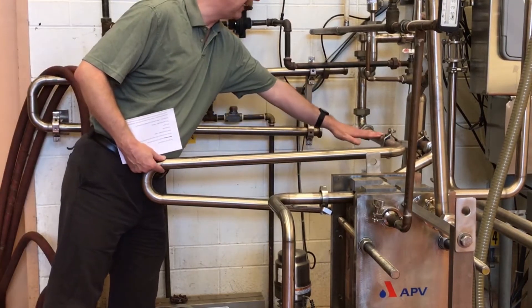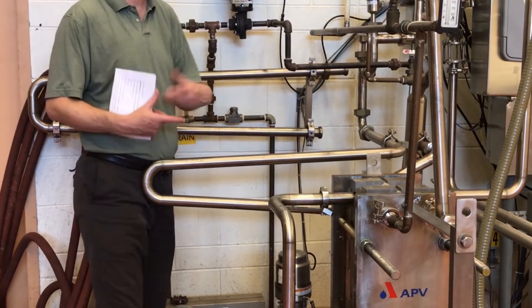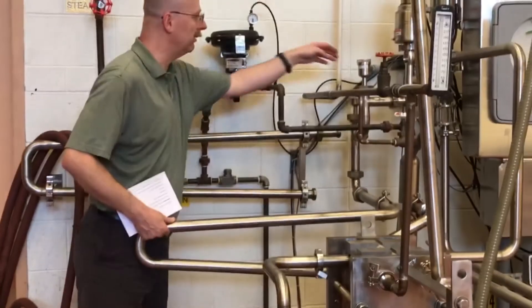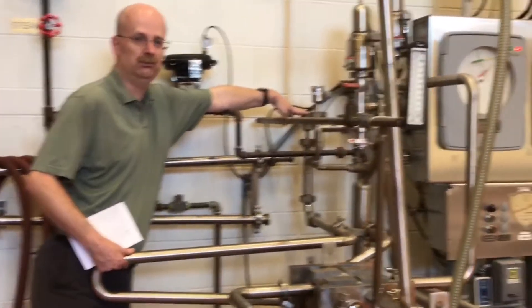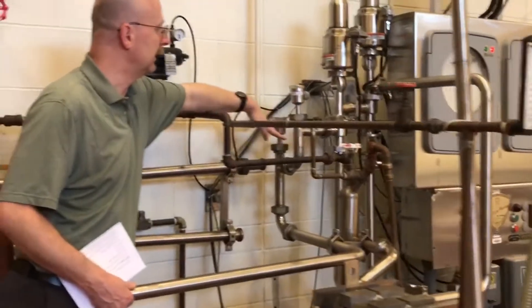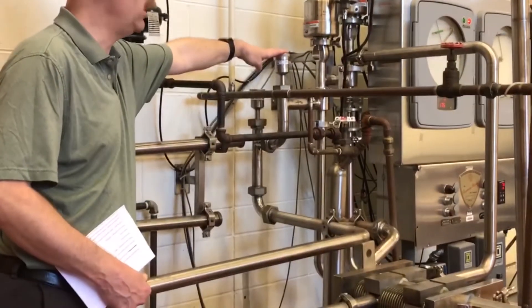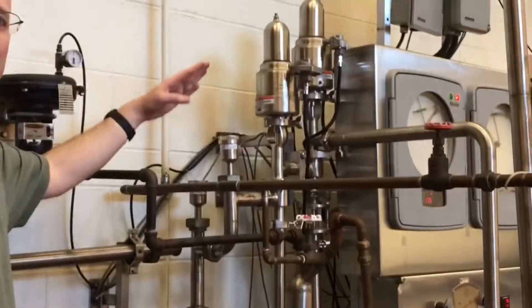Coming out of the holding tube, we pass through two sensors. The first sensor is an indicating thermometer which records the legal temperature of the pasteurized milk, and the second sensor records the temperature for the recording chart.